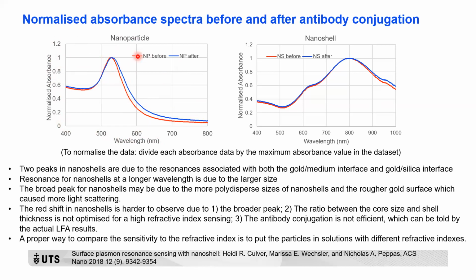I believe that's what all of you observed, and the drop of the peak may be related to loss of nanoparticle. Okay, so first, the dilution we use before and after the conjugation is different. After conjugation it is a little bit more diluted than before conjugation. And second, you will lose some particles when you remove the supernatant. So that's why you see a little drop in the spectrum, but that can't be interpreted as my conjugation being successful.